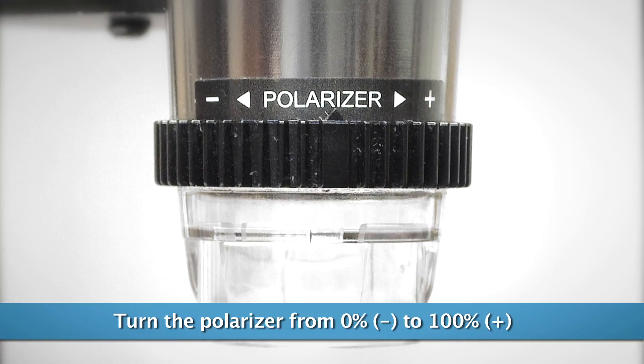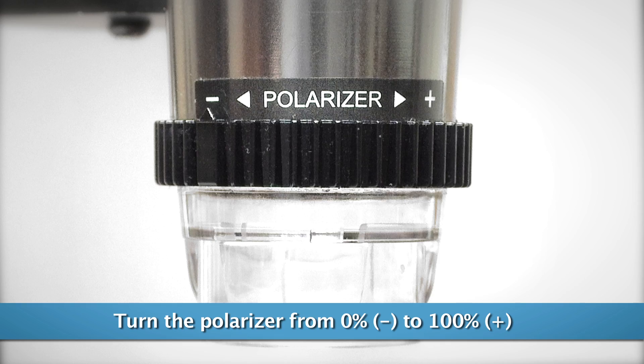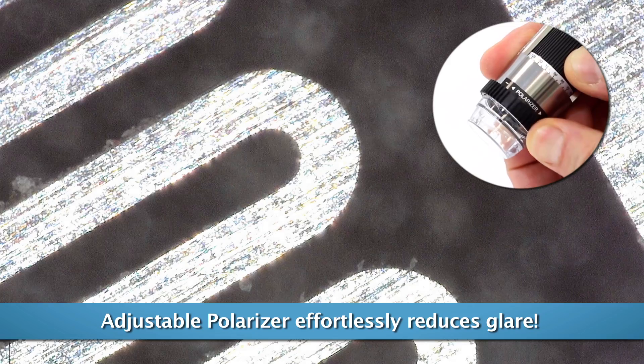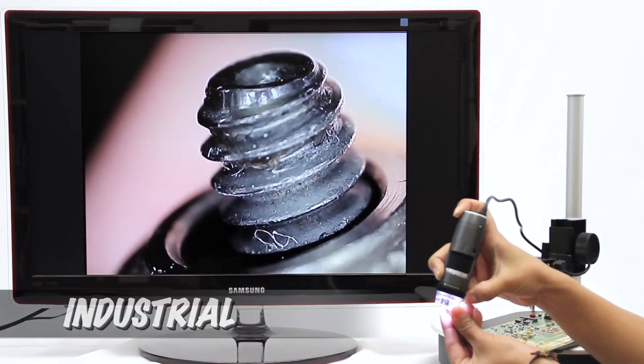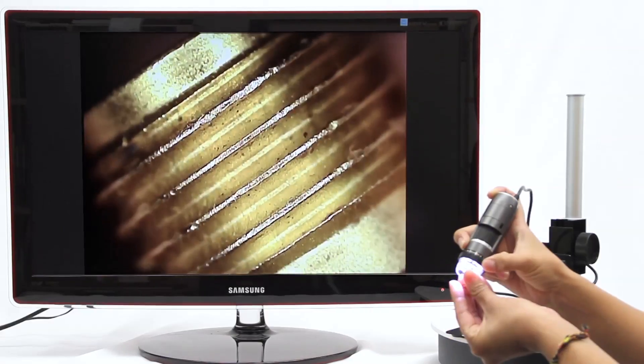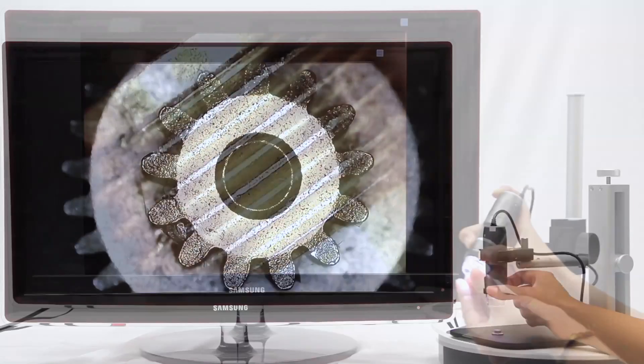The polarizer is fully adjustable from non-polarized to fully polarized and anywhere in between. This is useful because viewing objects in polarized light has different results. This level of clarity and viewing ability benefits users from all sorts of applications.